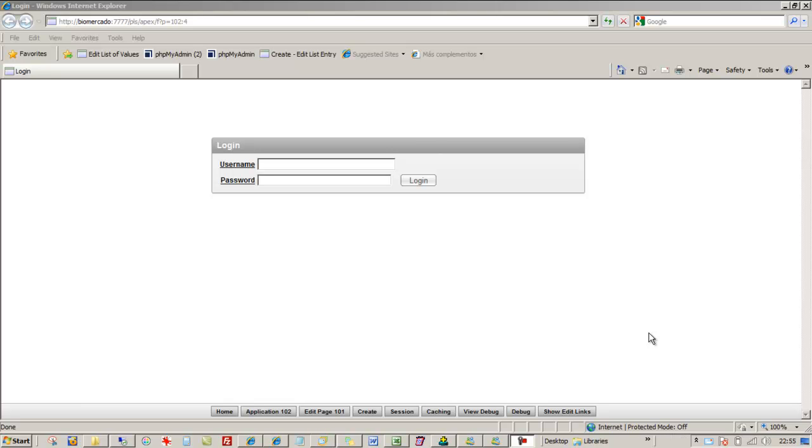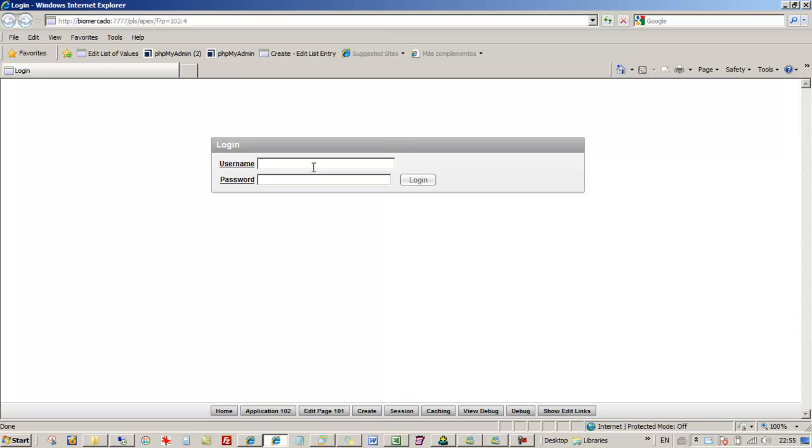I'm going to show you a very quick demo of the Ecobase database I did for the drinking water results, which I'm going to expand to handle some other data as well for yourselves and some other groups.